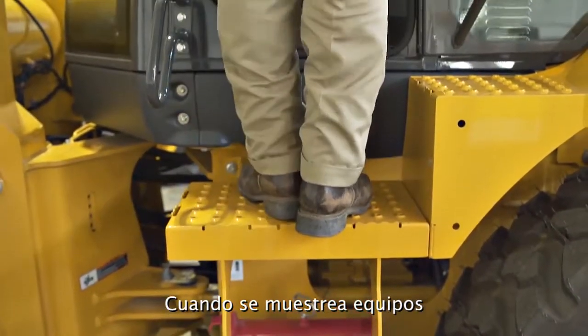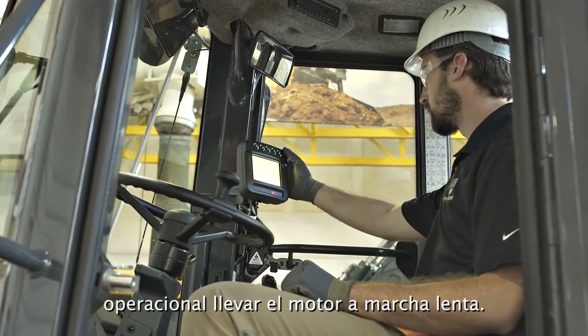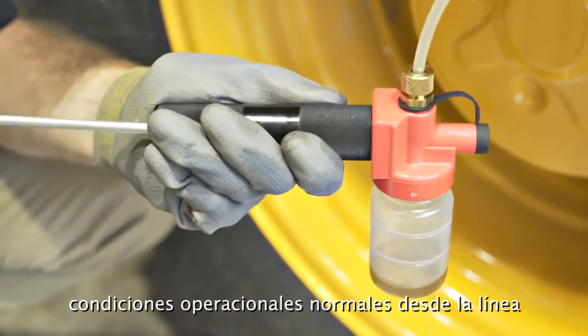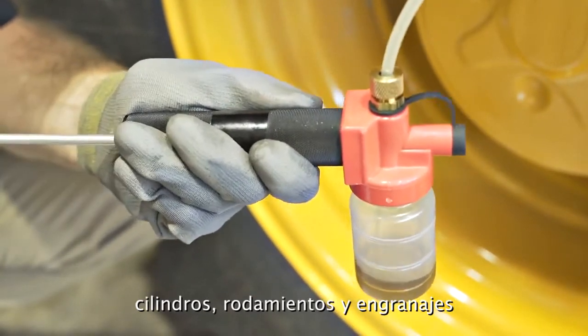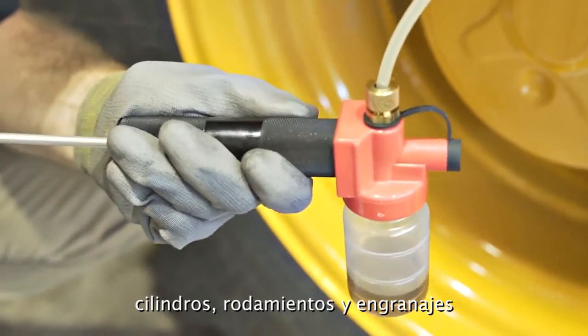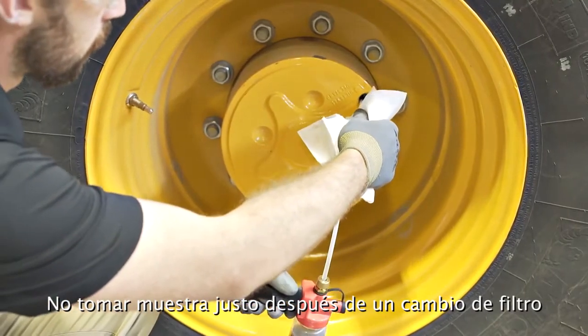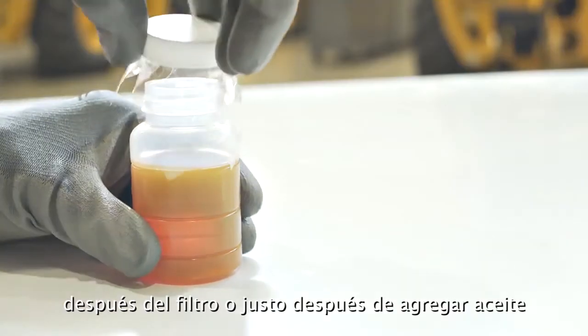When sampling mobile equipment, once the system has reached operating temperature, set the engine to a slow idle. Sample stationary equipment during normal operating conditions in return lines or downstream of pumps, cylinders, bearings, and gearboxes, and upstream from the filter. Do not take samples right after a filter change, on the outlet side of a filter, or after makeup oil has been added.